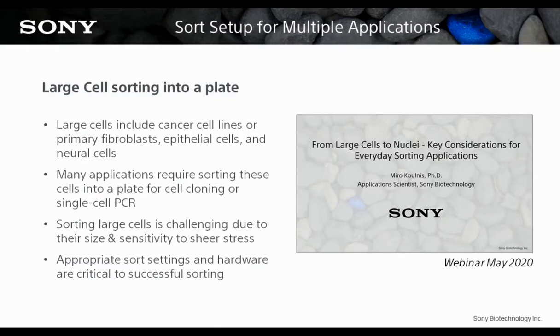For those of you who are interested to learn a bit more about this application, I would suggest looking at my previous webinar recorded in May of this year. Today, I will emphasize some of those best practices, as well as discuss additional useful features you might need for plating large cells.